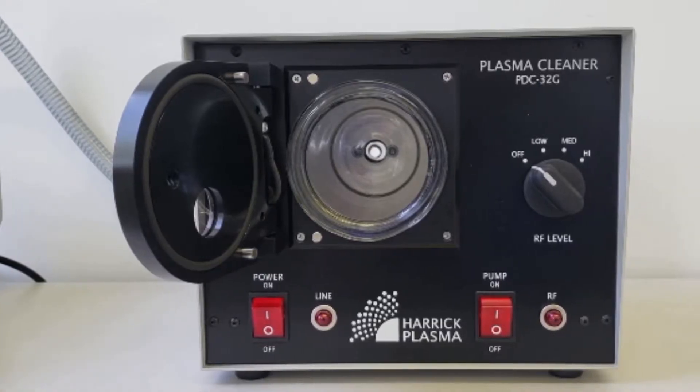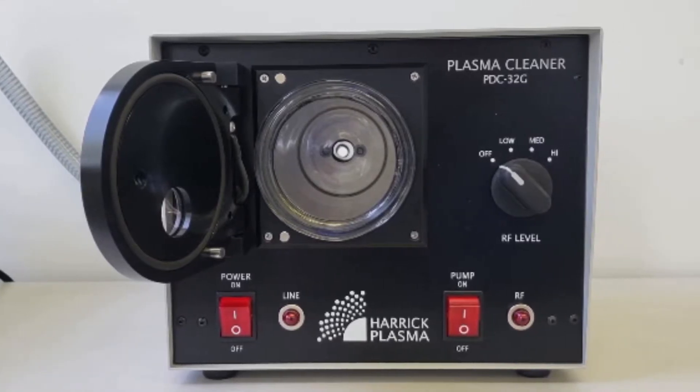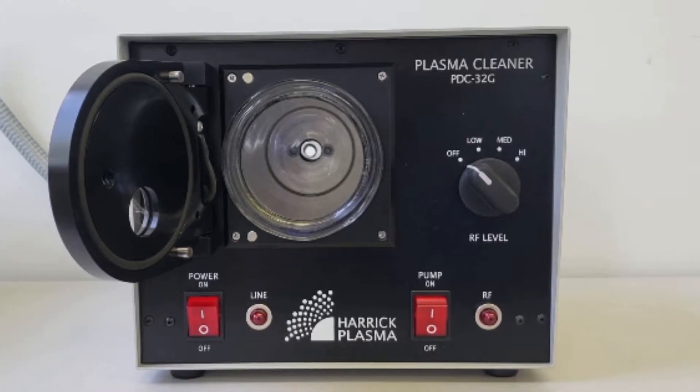If you are unable to form plasma, this is usually caused by either a problem with the electrical circuit or a vacuum issue. To check that the circuit is working properly, we will run the fluorescent bulb test.